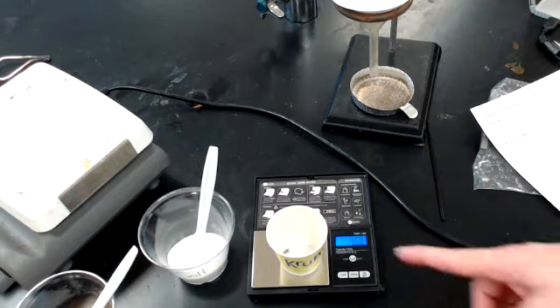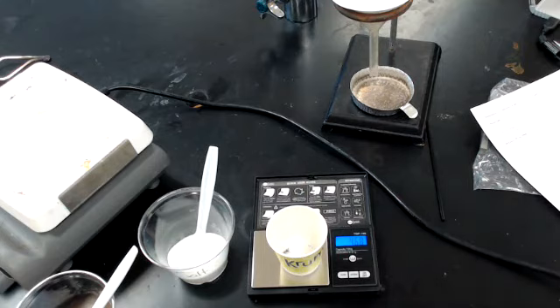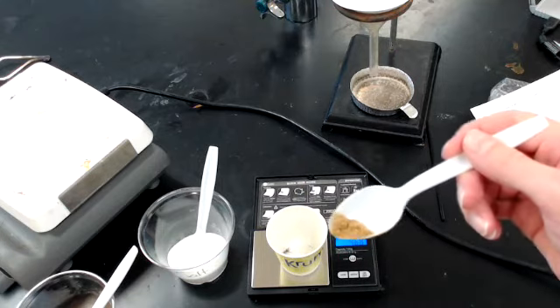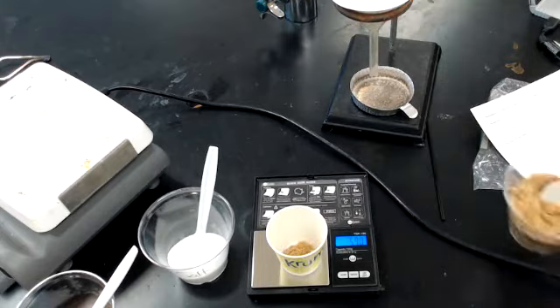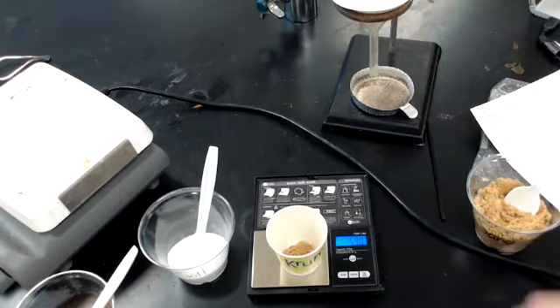Yeah, the balance is that sensitive. If I breathed heavy on this, it would notice. And I'm going to add some sand. So here's my sand. I'm going to add it to the container: 5.90 grams there. Okay, so you should have those in your data table for number 5. Later on I'll ask you to work with that.